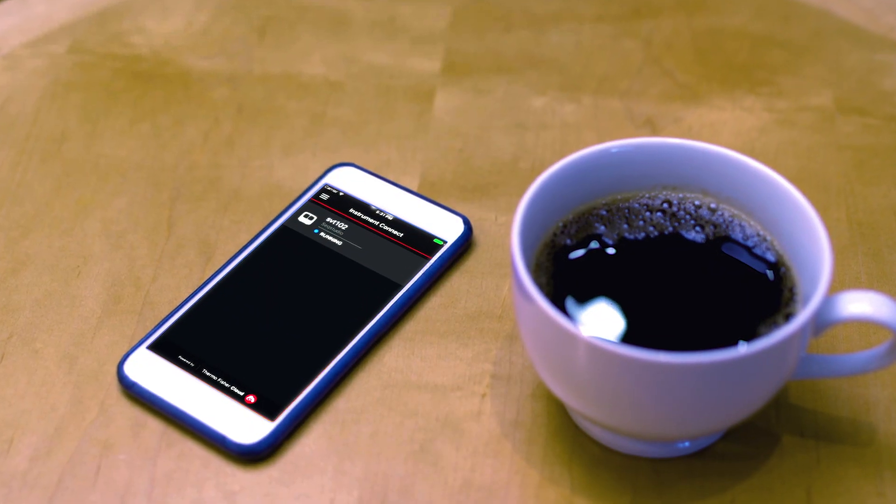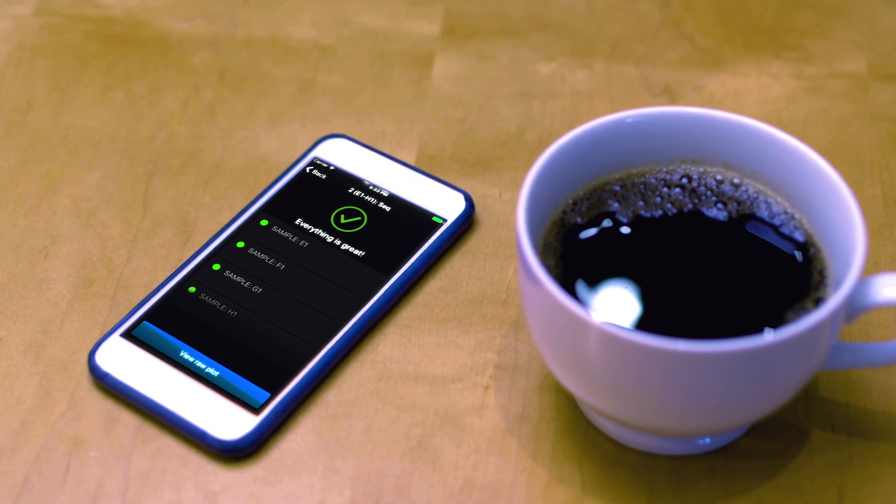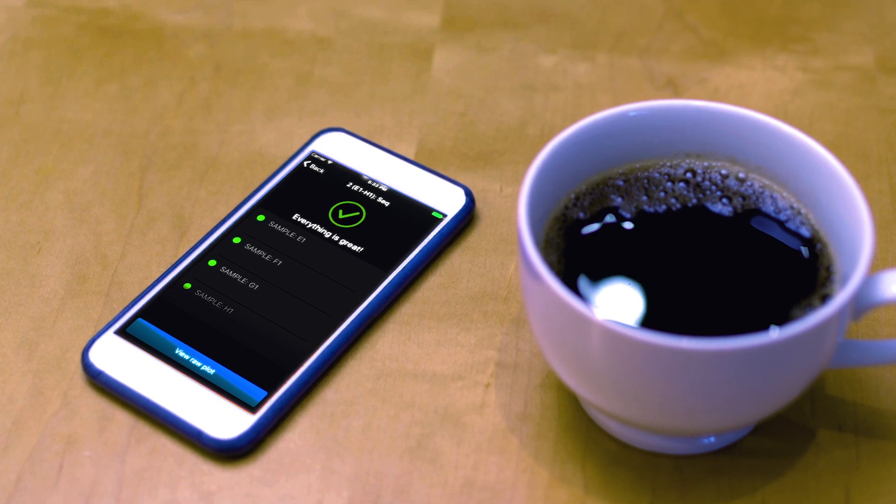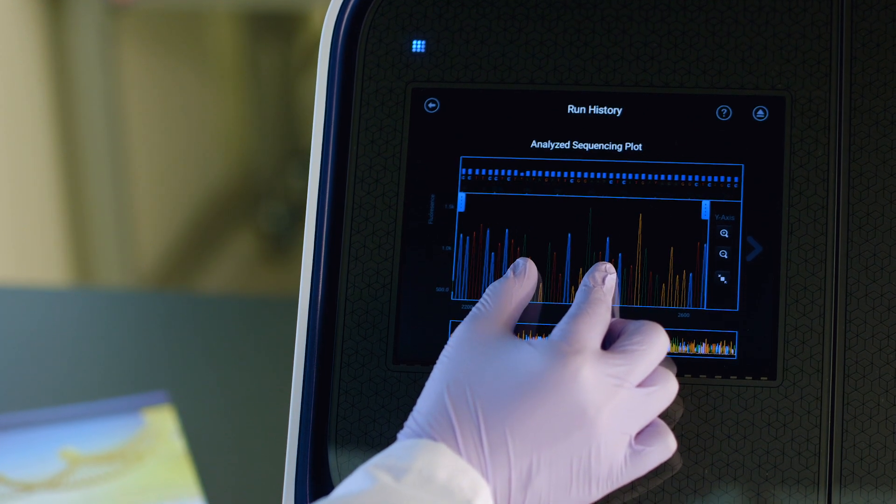Stay on top of your instrument's availability, monitor progress of a run, and view Sanger sequencing or fragment analysis data in real time. Instantly see base calls and run quality right on the instrument.